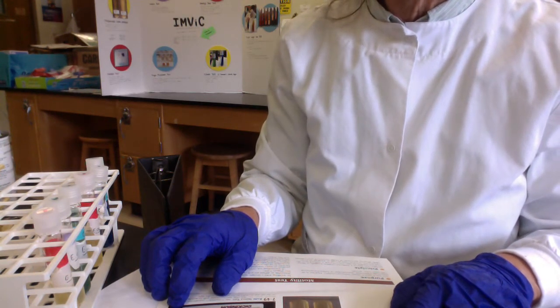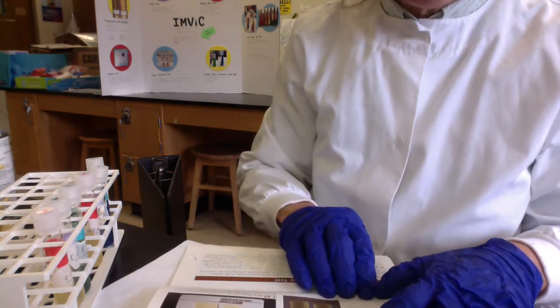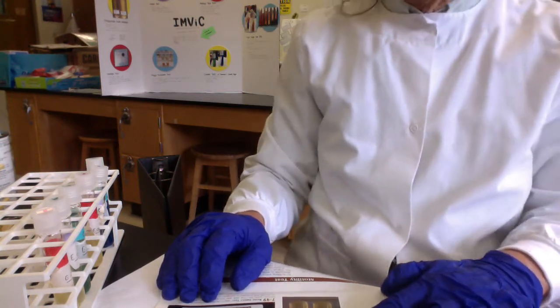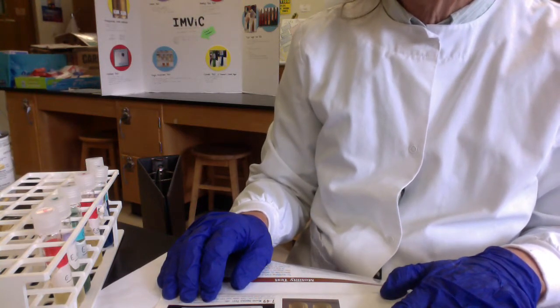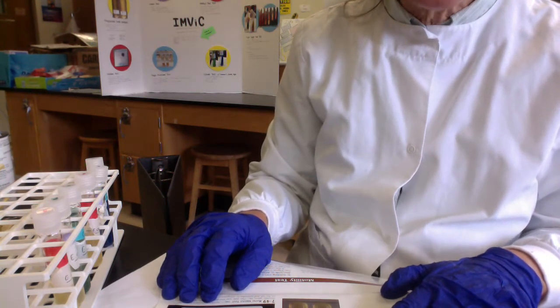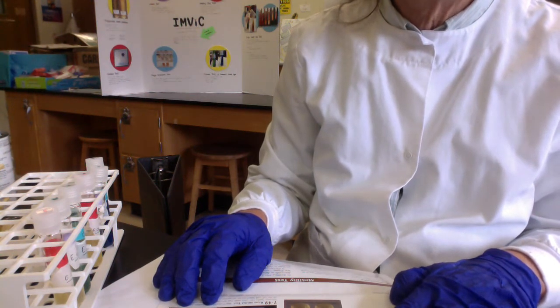Enterobacter aerogenes can live in the intestinal tract, but it might also be found living in dead or decaying organic matter out in nature. So if we're only finding lots of Enterobacter aerogenes in, say, drinking water, but no E. coli, it suggests it might not be fecal contamination, but maybe just some environmental contamination. So the reason the IMViC tests are so helpful is that E. coli has the exact opposite test results as Enterobacter aerogenes.